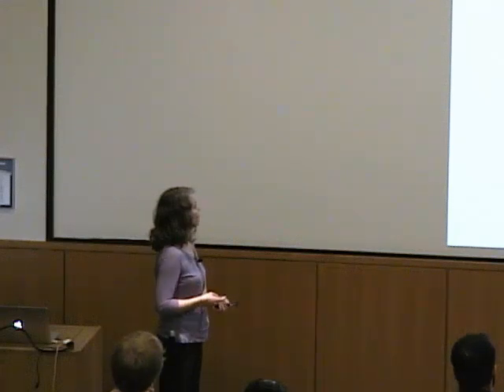Okay, so this is just a summary of what I'll be going over today. I'm going to start out with some introductory material. I will go over what will be a review for you of NMR fundamentals, just to make sure we're all on the same page. And then I will spend some time talking about nuclear relaxation in NMR, because that becomes very important to understand some of the fundamentals of when you consider NMR of paramagnetic systems. And then I will talk about mechanisms and examples of effects of unpaired electrons on relaxation and on chemical shifts in NMR spectra.